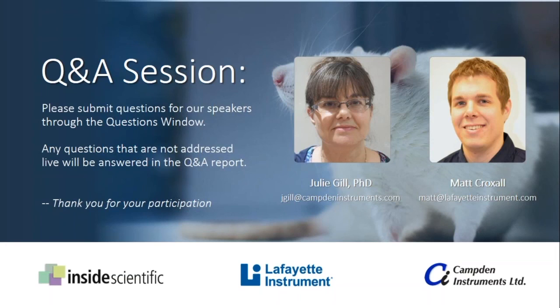We've had this question a couple times now, from the Rutgers Brain Health Institute in New Jersey. They've asked if we can train the rats to hold a screen touch for several seconds before releasing the screen touch. Can either of you comment on that? I think you've got some experience with that, haven't you, Matt?